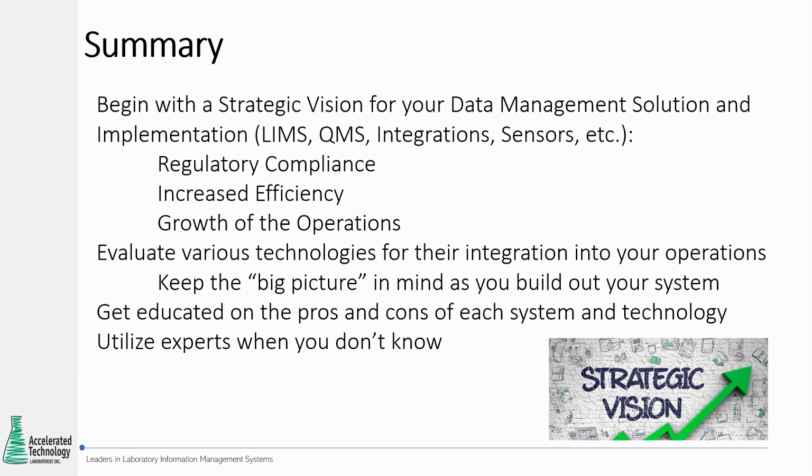In summary, I think it's very important to begin with a strategic vision of where you want your laboratory's data management solution to end up. The role that a LIMS plays with a quality management system, along with all the integrations with not just enterprise systems, but also instrumentation and leveraging sensors throughout the laboratory, really makes sense in terms of maximizing your resources, reducing your cost, and increasing your productivity.